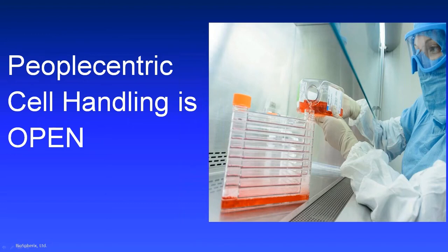So the cells are actually out of optimum conditions for longer than you actually have them in the BSC. It takes them a long time to come back into optimal conditions. We call these suboptimal transients, and in traditional room air culture, cells are exposed to them all the time.